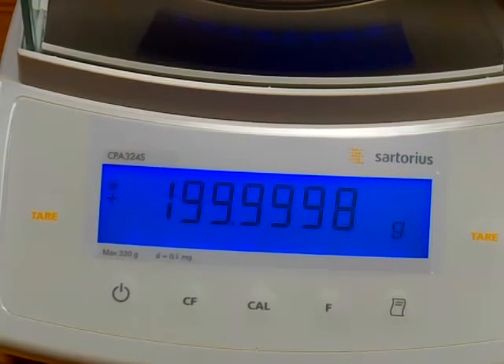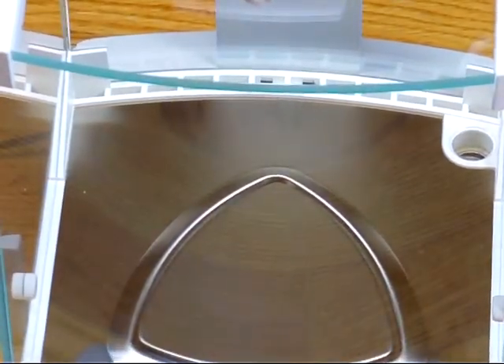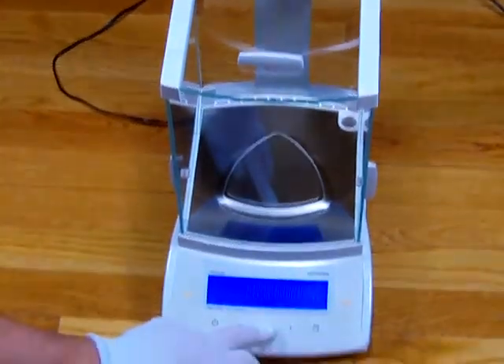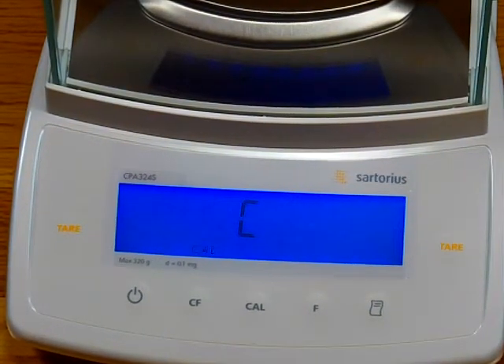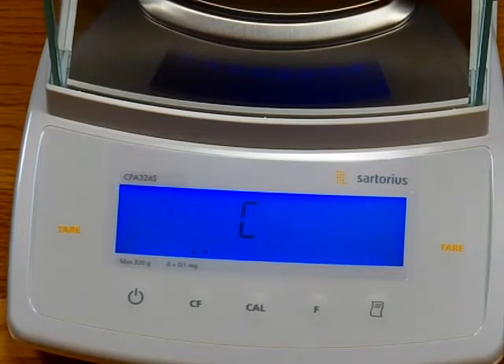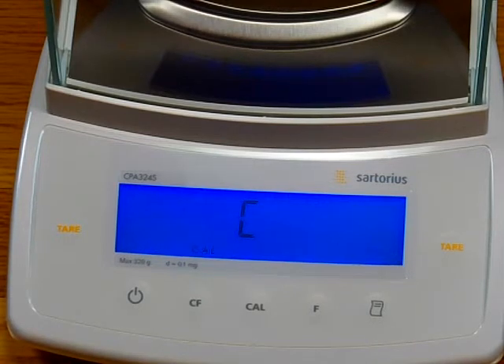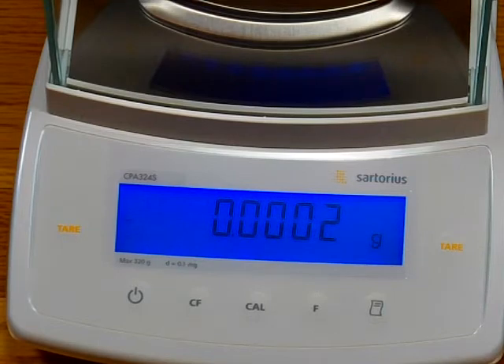The calibration weights can't even be calibrated as accurately as the balance can measure. This is really spectacular performance. Another beautiful feature of the Sartorius CPA series is motorized internal calibration. Simply by pressing the CAL button in the center, the balance automatically drops the calibration weight and performs the calibration. We're hearing the motor drop the weight. At the end of the calibration, it shows you the difference from the last time the balance was calibrated — in this case, the balance was adjusted by 0.0002 grams.